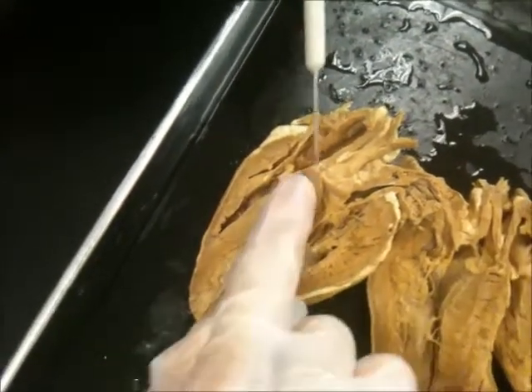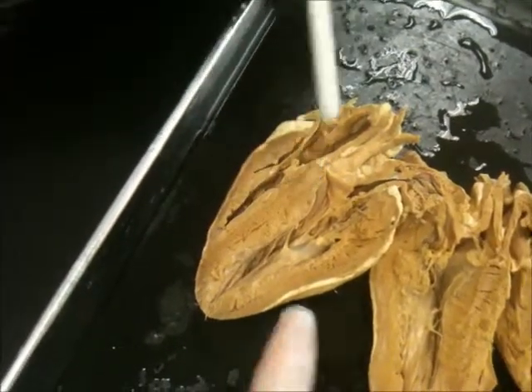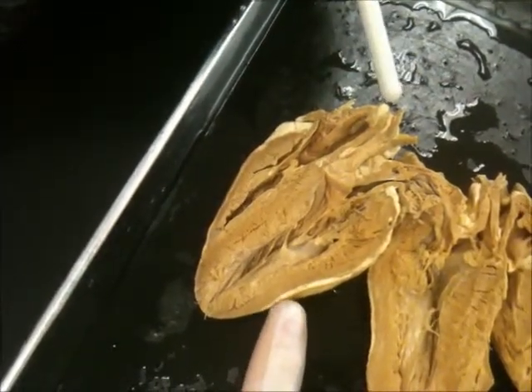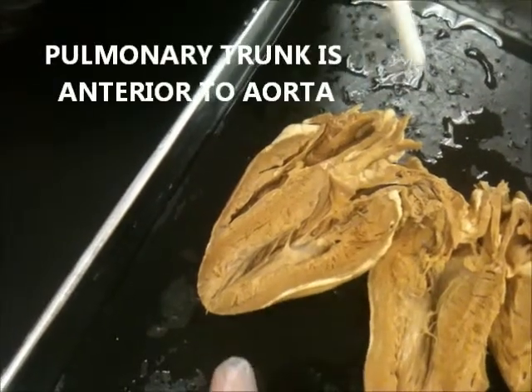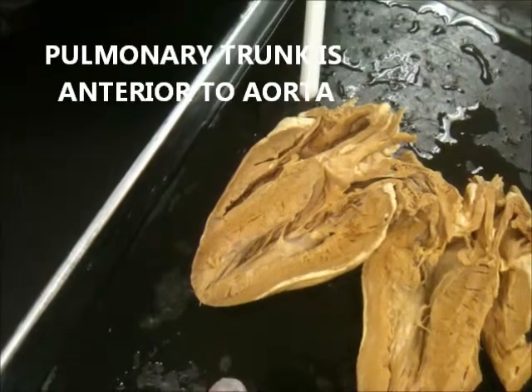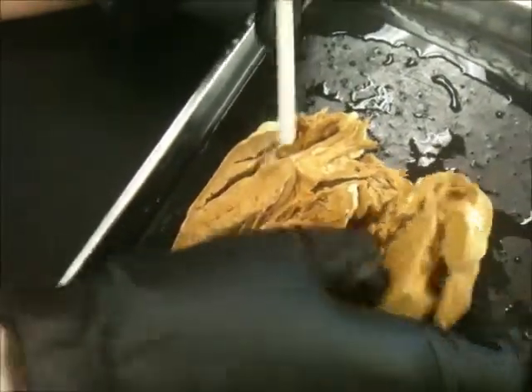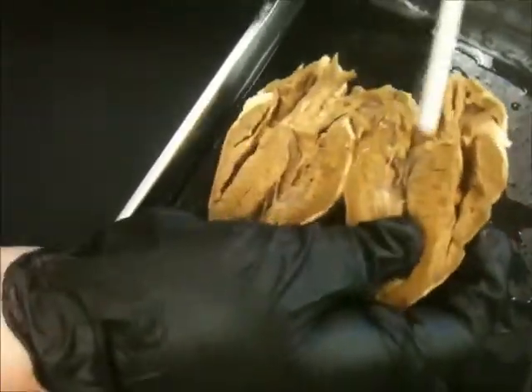Interventricular — right here? Exactly. The pulmonary trunk is the hardest to find. I made some notes on my sheet, but it is anterior to the aorta. So there's the aorta — that's the aorta.